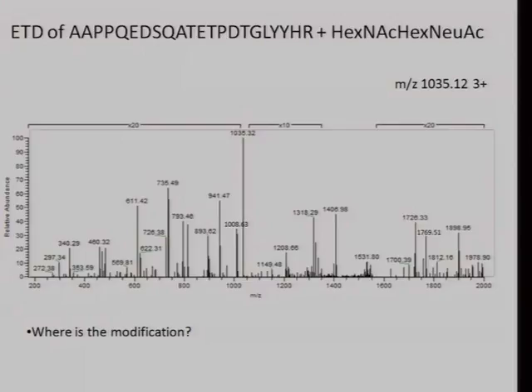In the case that we have those results, we can build a dynamic model from all of them. I don't understand the question.